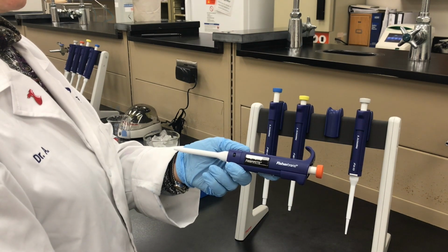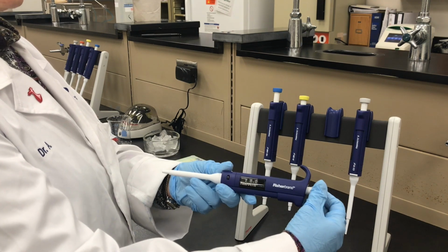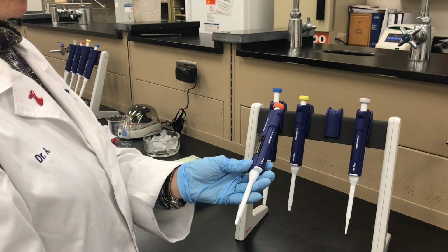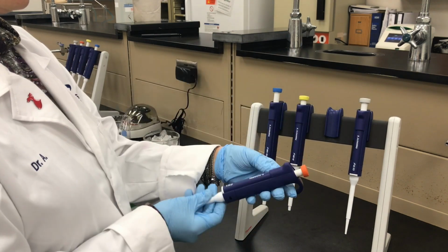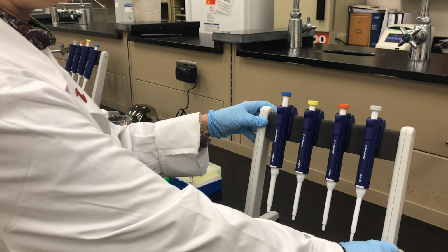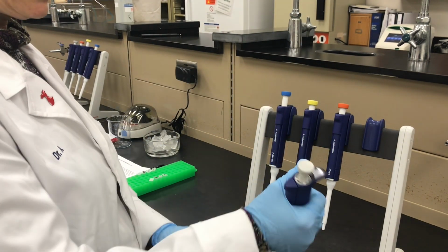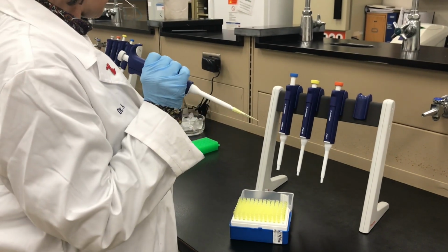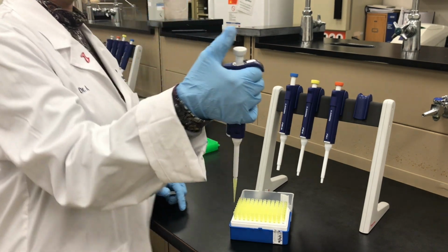I'm going to put this to 20 because I think that's one of the volumes we're going to be using. So when you're ready to use it, you set the volume, okay? And we'd be walking through this together anyway. So I'd tell you if you're using the gray or the orange. Set the volume. Now, how do they actually work? We have disposable sterile tips. So you put a disposable sterile tip on it, and then hold like so.